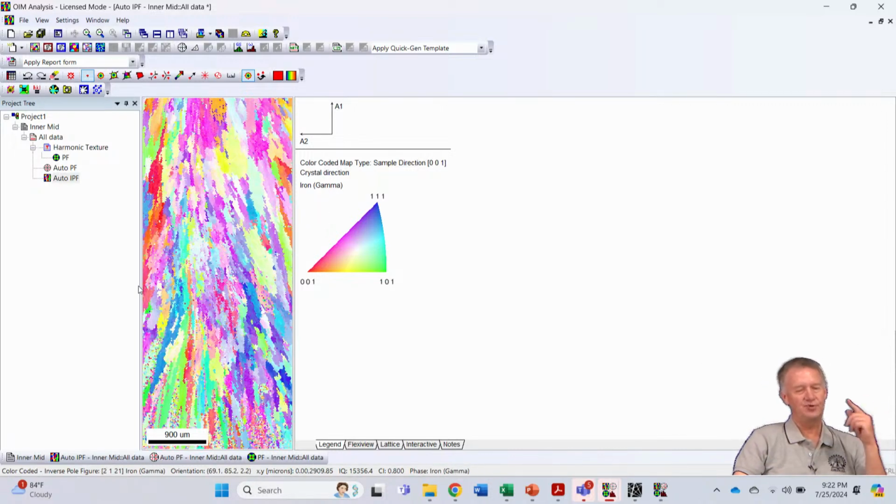Now, if we think it's really coming out of the page, one thing we can do is just rotate our data and put it in the right position. So that means that my A1 will be out of plane. A1 we usually say is our reference direction, and so it would be straight up and down. But in this case, if A1 is aligned with the growth direction, it would be tilted in or out of the plane a little bit, right?